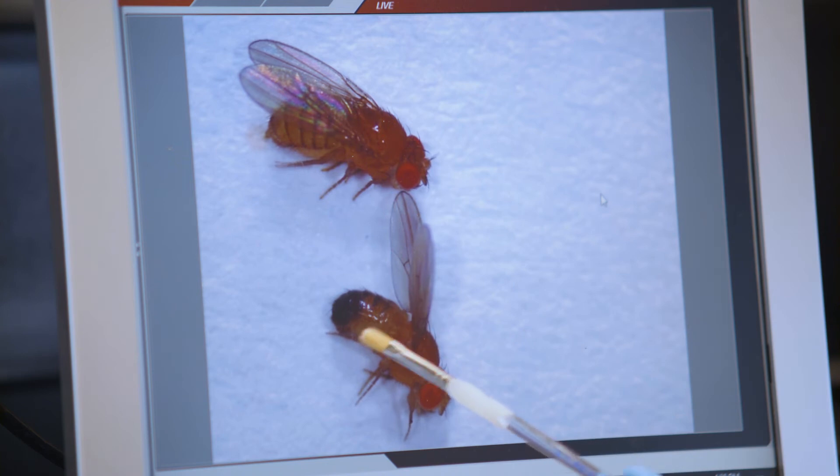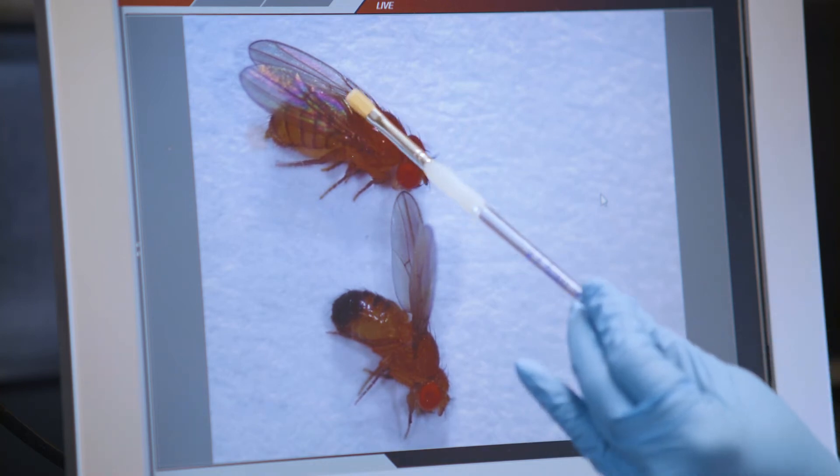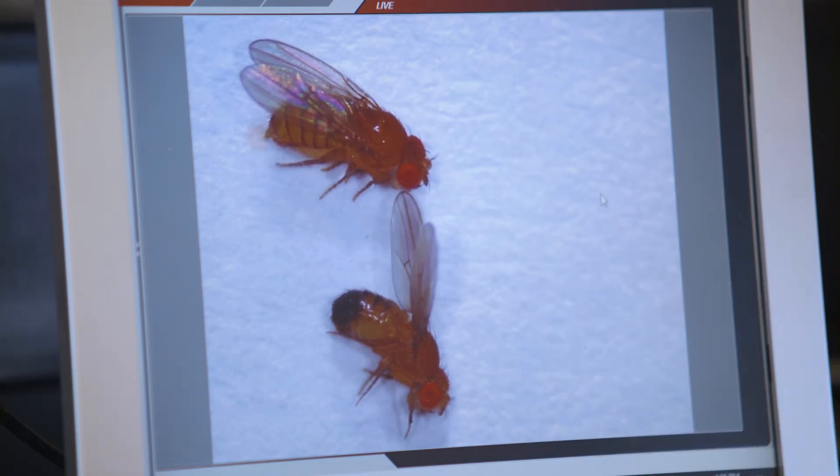The other thing to note is the pigment. The male has this nice dark blotch of pigment at the tip of the abdomen, whereas the female has a nice striped pattern extending across the abdomen.